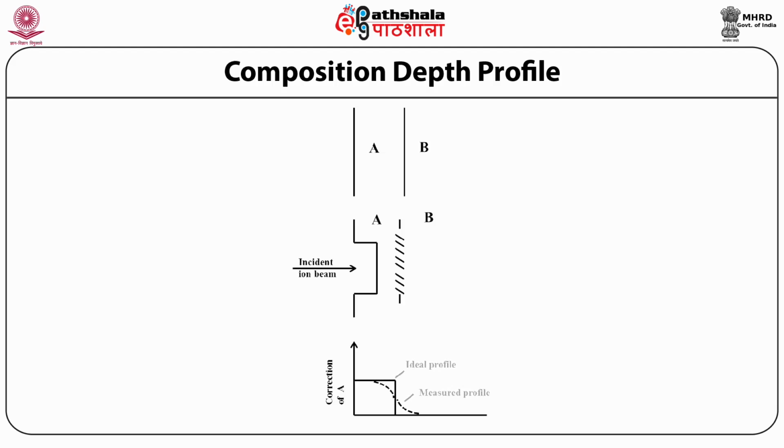A profile of the compositions at the surface and near the surface could be known by examining the evolution of the AES and XPS spectra through the crater at different depths. For analyzing the depth profile quantitatively, it needs to measure the depth very accurately in addition to estimating the concentrations.